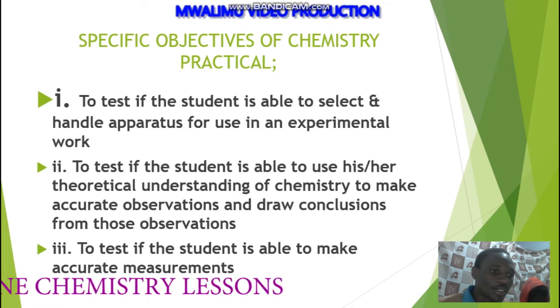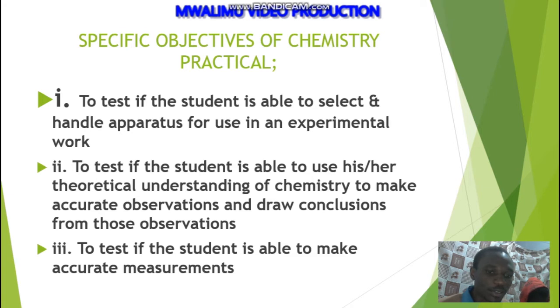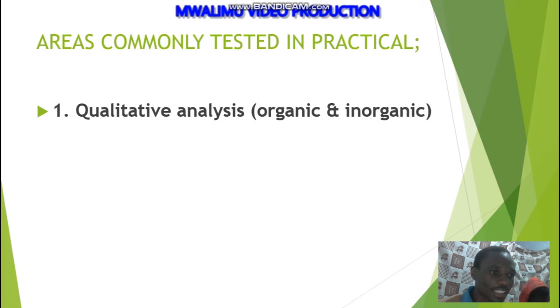It also tests the student if he or she is able to make accurate measurements. And the areas commonly tested in chemistry practicals are, number one, qualitative analysis.